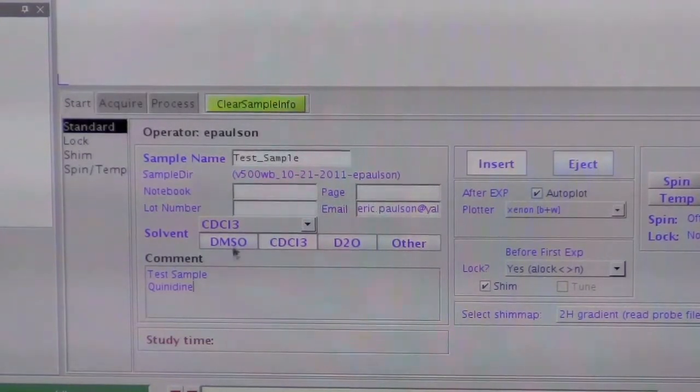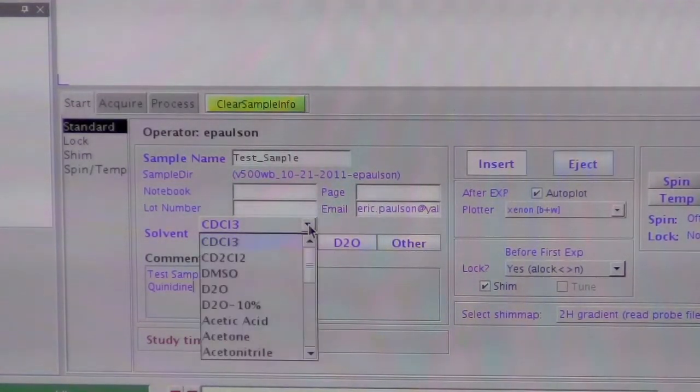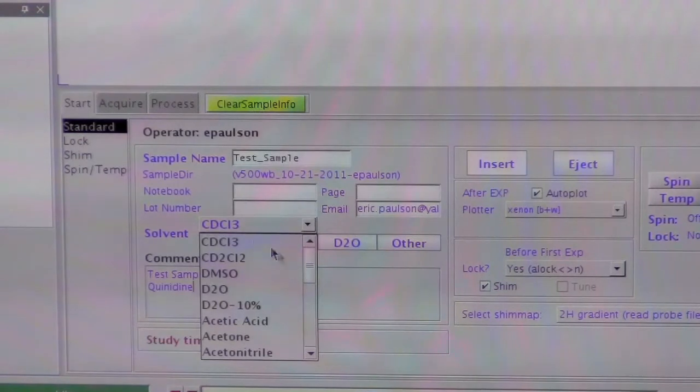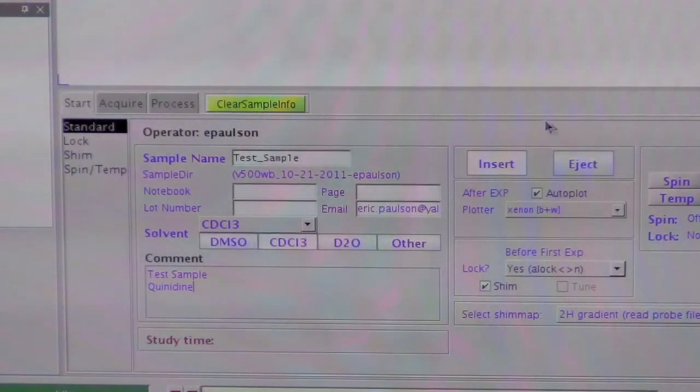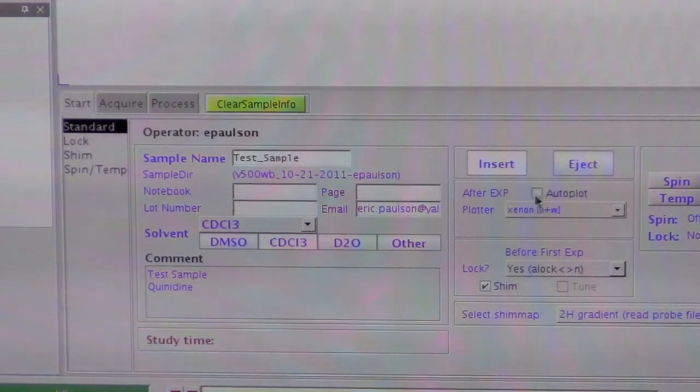You should choose the solvent. Some of the common solvents are here. All of the solvents are available from this dropdown list. And over here, you can decide whether you want it to automatically plot or not. I'm going to turn it off.